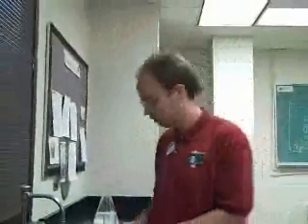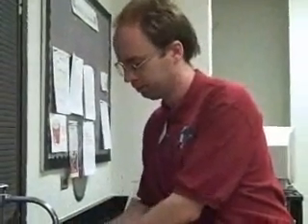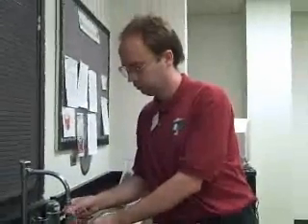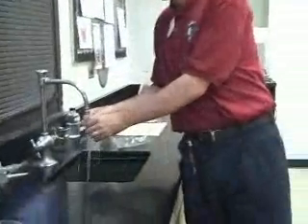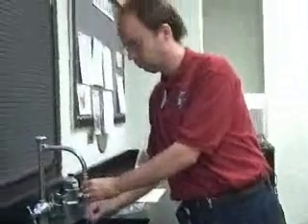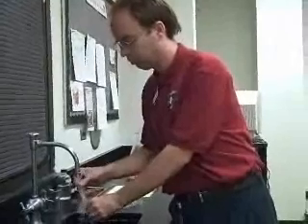Okay, our next set of exercises are demonstrating dialysis in non-living systems. You have probably heard about dialysis before. Now, in medicine, we use dialysis for people who have kidney problems.